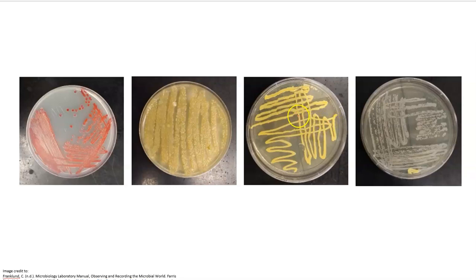And it looks like in several of these, they went over 3 times and through a large portion of the prior quadrant. This one's not a bad streak plate by any means. I definitely do see some isolated colonies in there, so I would consider it a good one. The main concern here is this yellow growth.